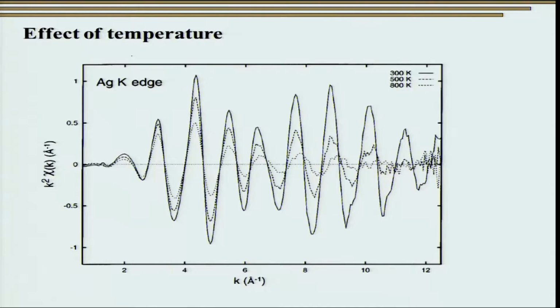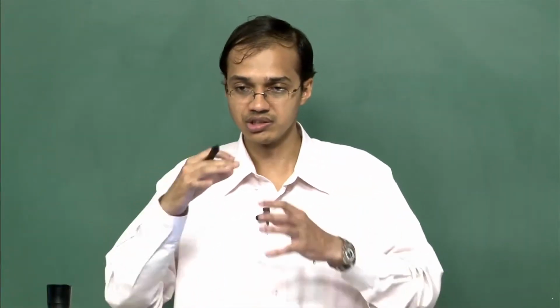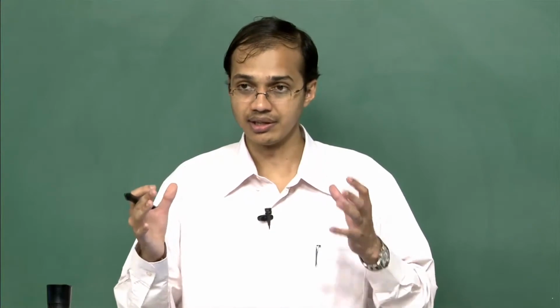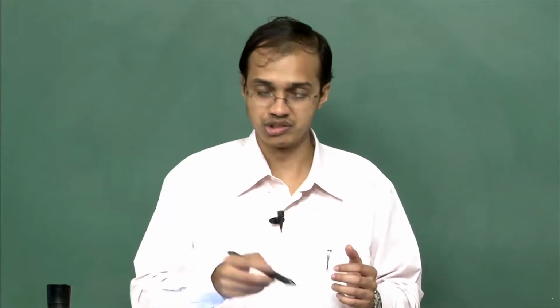Here again I have just mentioned to you that we can carry out various tests in situ, like heating as well as applying pressure. So, just to show you what kind of effect we have, if we apply temperature, we see that there is a continuous decrease with increase in temperature. These are some practical limitations that we have, but remember all these oscillations correspond to the interference between the waves that are being scattered from the surrounding atoms, and you see that as we increase the temperature, there is a decrease in the oscillations.